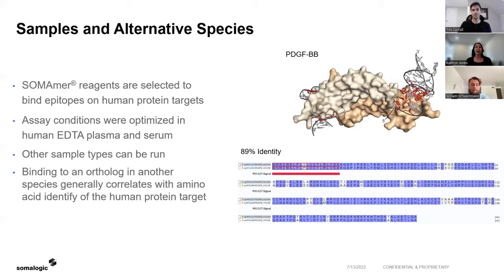Other sample types can indeed be run, despite not going through the rigors of validation for every possible sample type out there. A lot of value can still be realized from proteomic exploration in unique matrices. Examples are identification of biomarkers of stroke in rodent CSF, comparing the proteomic profiles in tumor tissue samples, understanding drug toxicity in cell lysates, or understanding molecular mechanisms in non-human samples.